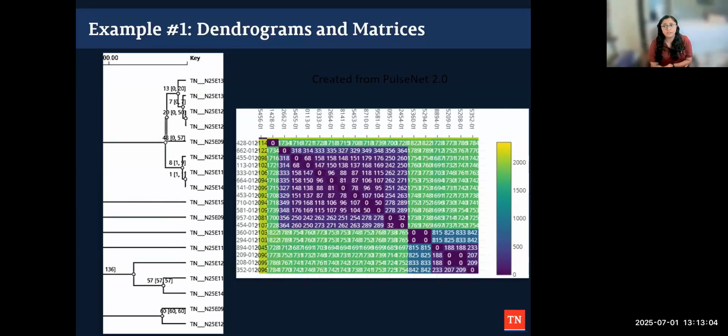And then, I mentioned that there's other platforms out there that can do different types of sequencing data visualizations. Some of those are linked in the chat. Thanks, Lauren. They include Microbe Trace, NextStrain, MicroReact. Some of these are free, some are not. And then I'm sure there are probably many other platforms that exist that I'm not aware of or particularly familiar with.